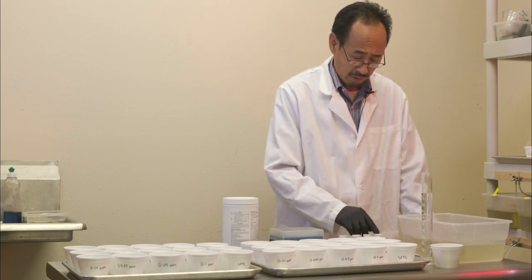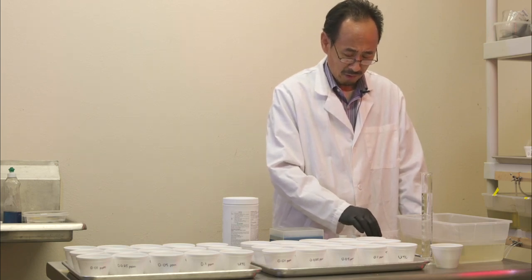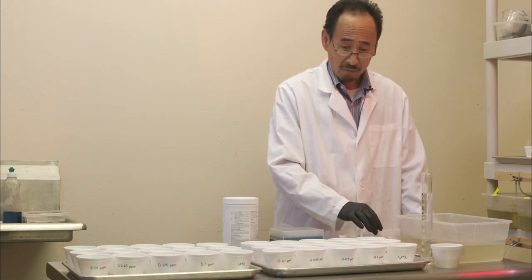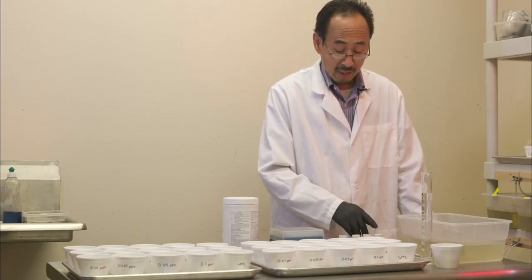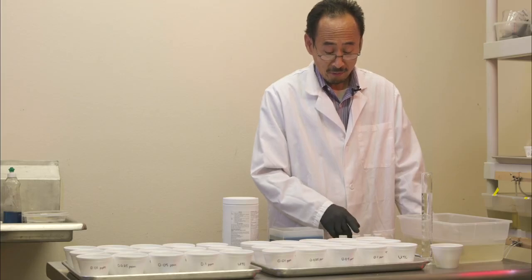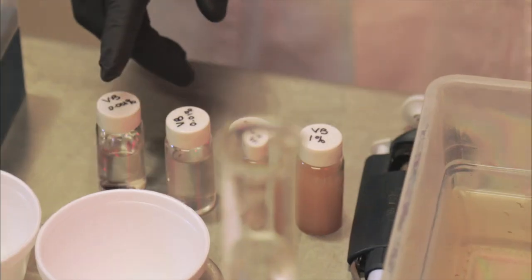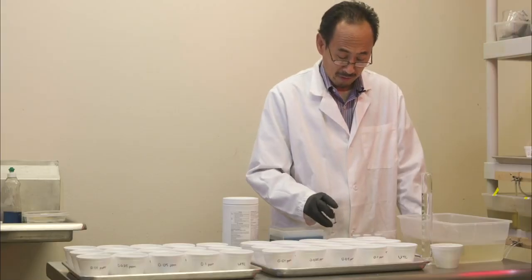After I add 200 milligrams of WDG to the first vial, which is 20 ml volume, you shake it really well, make it well suspended. Then you take 2 ml down to the second one, then mix well, then 2 ml to the third one, and 2 ml transfer to the fourth one. And the fourth one is the one you're going to use for your treatment.